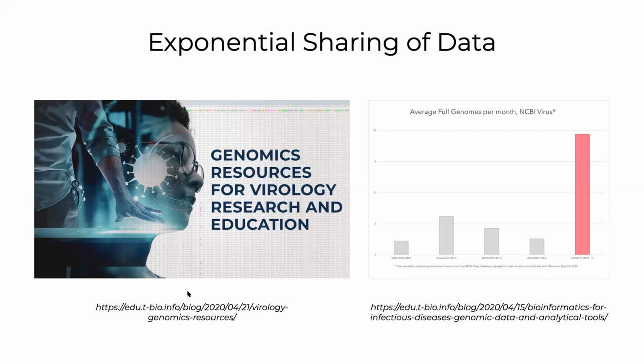But approximately what we showed here with the consensus genome is exactly what will be the outcome, right? A complete sequence of a full genome, including some of the information about what's in that genome. For example, what genes and what other genomic elements are present.